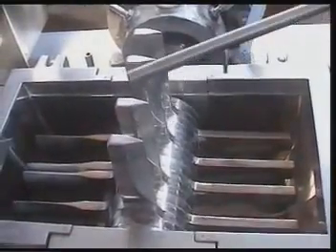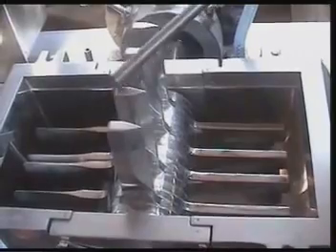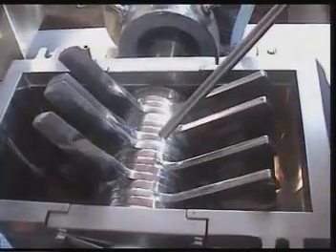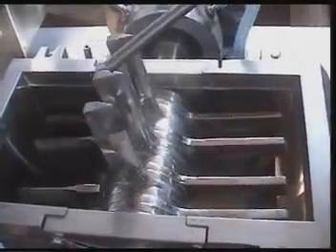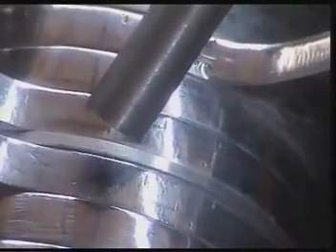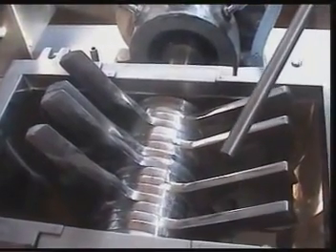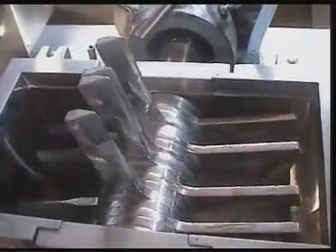These are the 16 fixed type beaters mounted at different positions and different locations, as you can see. In the center, there is a distance spacer provided — which we call it as a distance spacer. There are different positions of the fixed beaters.